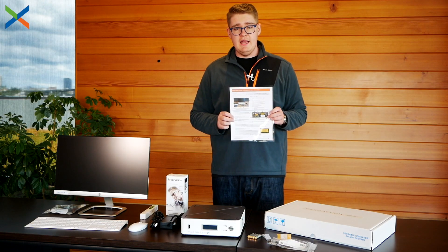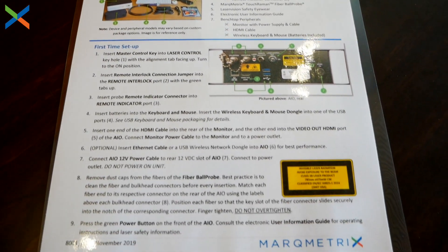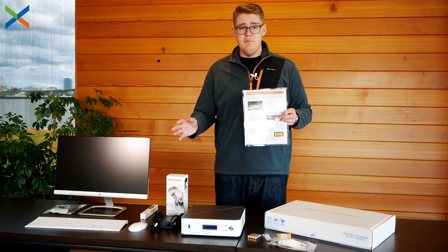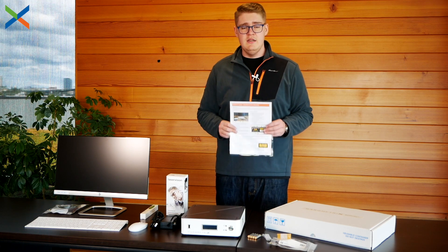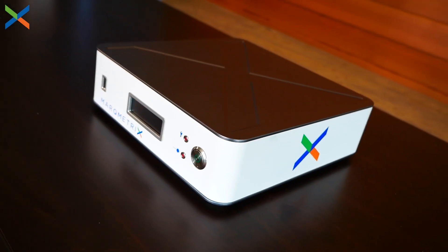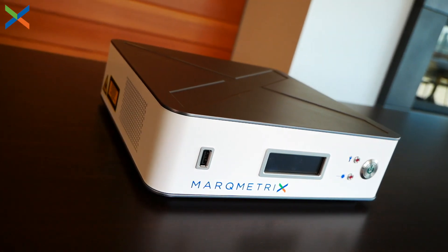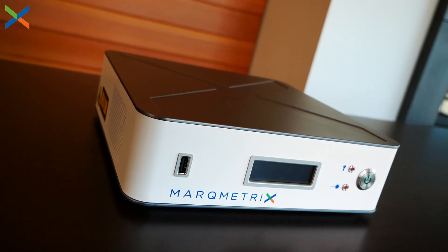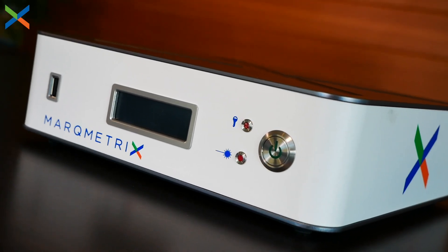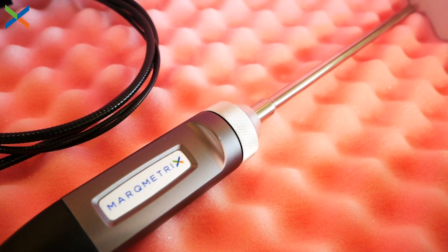Please also check the boxes for a packing list and the quick start guide — it will tell you everything that should be in the boxes, so double check to make sure you have everything. Also take note that your individual system might look a little different than this one, as we build different systems for different use cases. Just refer to your quick start guide and packing list to make sure you have everything you need. By the way, the MarqMetrix all-in-one system is very easy to pack and travel with.